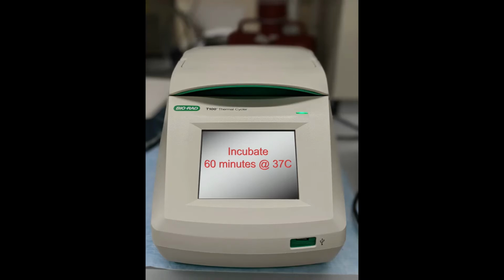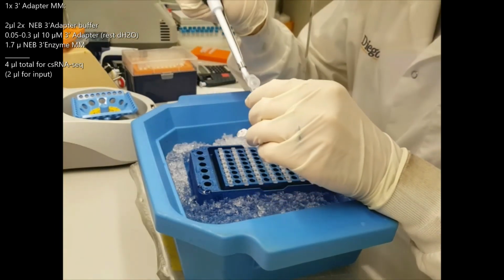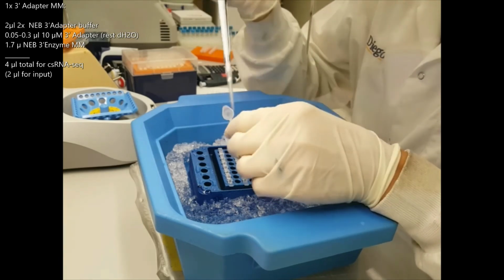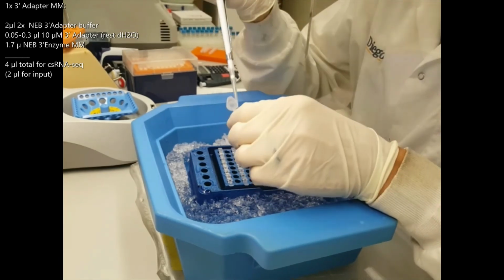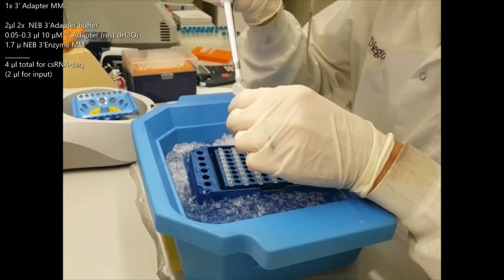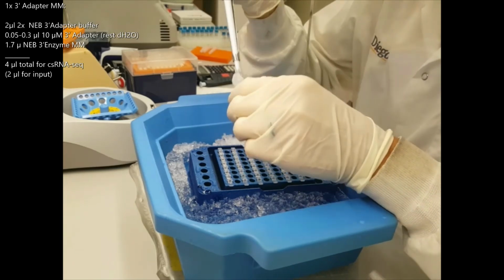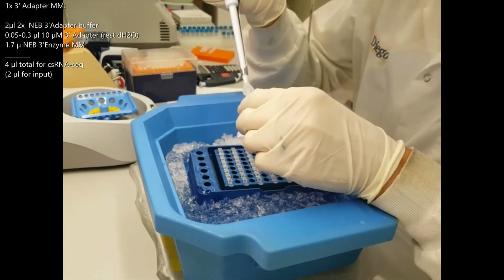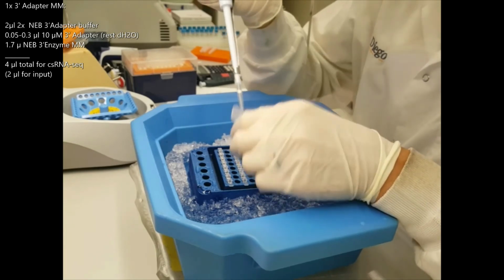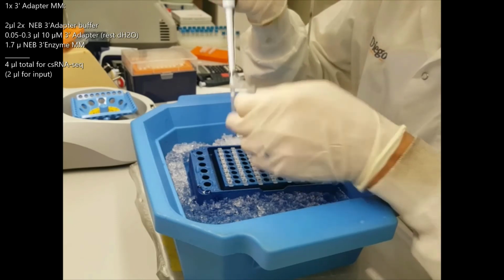Here you can either use a home brew setting as described in the Hetzel paper with T4 RNA ligase 2, or use kits like the small RNA kit from NEB, which I personally like a lot. For beginners, I would recommend to just start with the NEB small RNA kit. Here, mix 2 microliters of 3' NEB adapter buffer, which already contains PEG and a lot of the nice stuff, with 0.3 microliters of 3' adapter and 1.7 microliters of the enzyme.